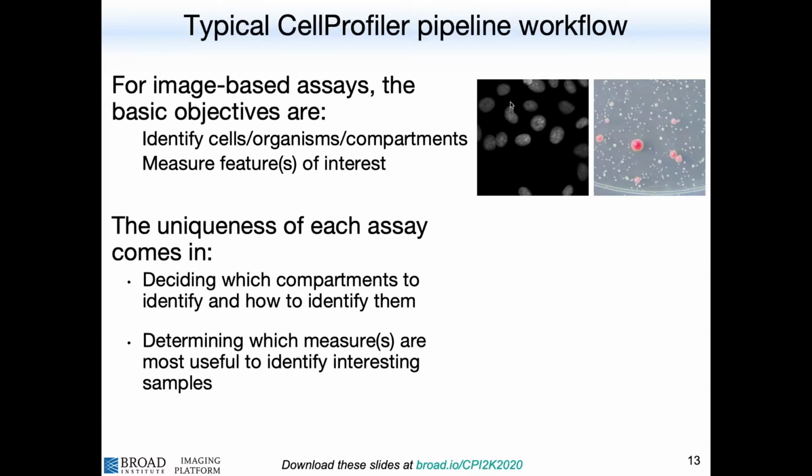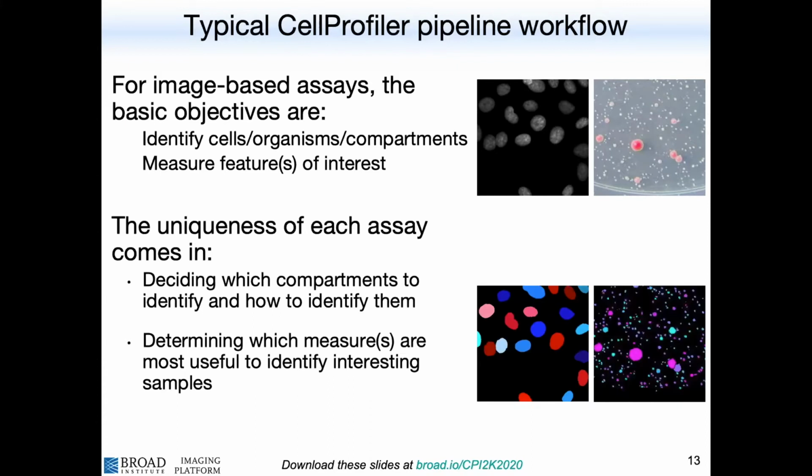So how do we come up with a pipeline that can find the objects that we care about for anybody's individual experiment? Because there are many kinds of biological experiments, with biologists working and creating microscopy images.